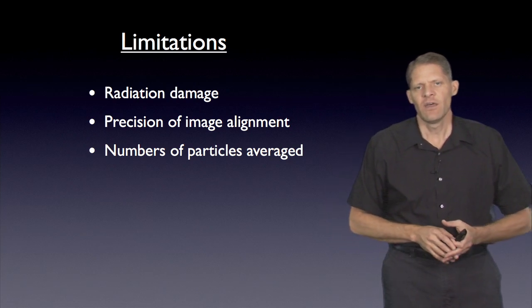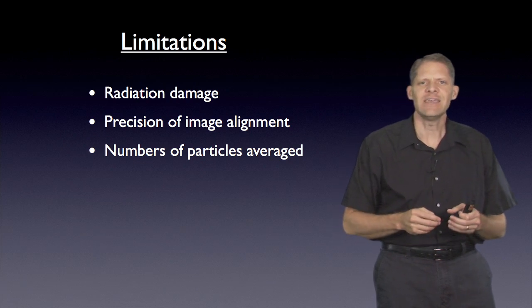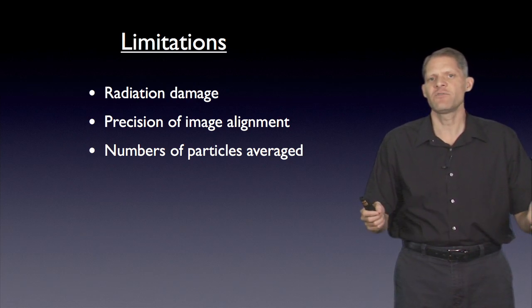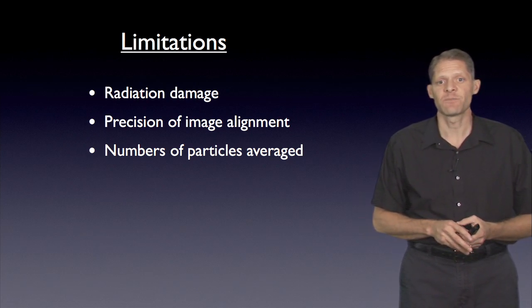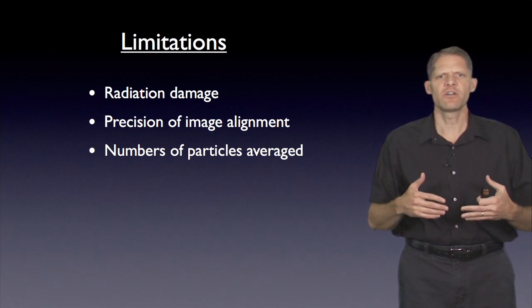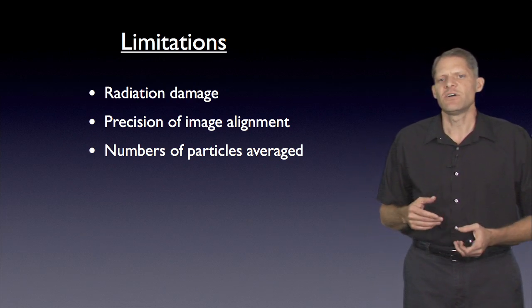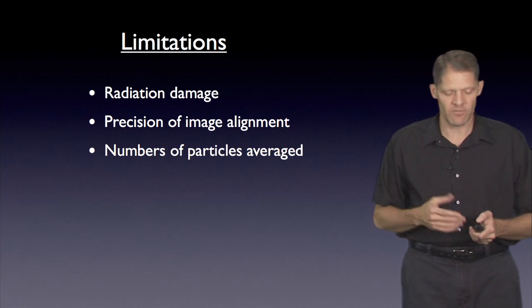And most recently, the advent of direct detectors and motion correction has increased the quality of the images included. And so reconstructions with resolution good enough to build atomic models have been obtained with just tens of thousands of images. And so while including just tens of thousands of images is no longer a big challenge in terms of either microscope time, computer storage ability, or computing time, still the number of particles included in an average is a fundamental limitation of the resolution.